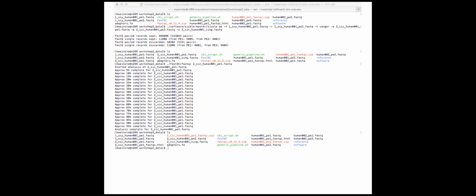All right, when you run the command and you just get the splash screen, there's a very good chance that you probably have the command wrong. So what I want you to do is copy the command you used to try and run it into the chat window, and I'll see if I can troubleshoot you from there.